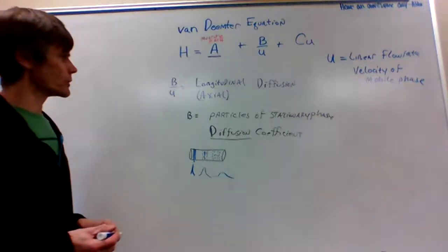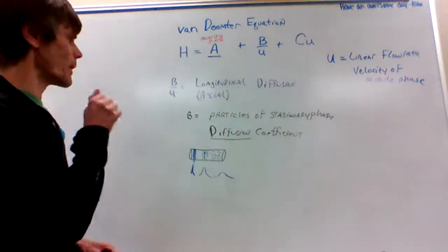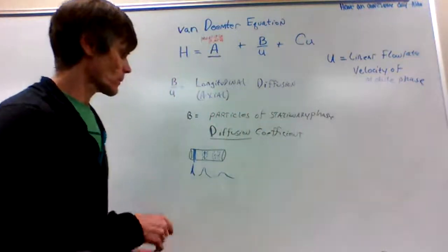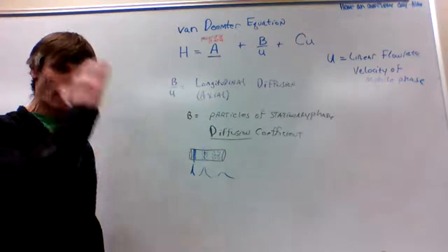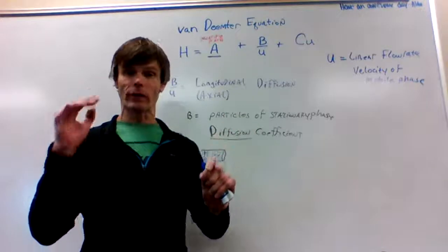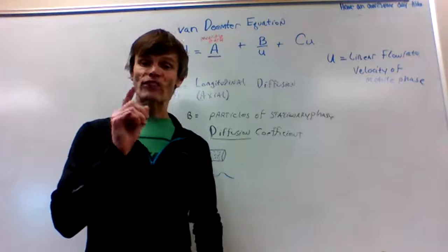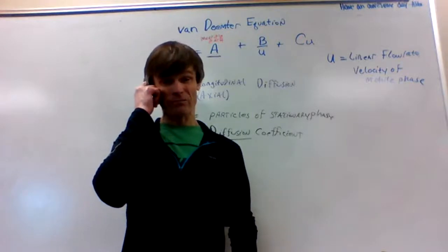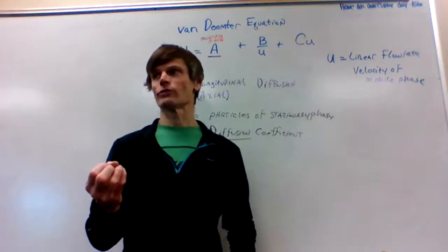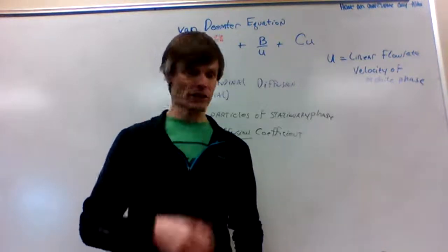Now, my question is, why is it inversely related to our flow rate? So let's think about what we can do here. We could speed the flow up. If we speed the flow up, we're going to beat that diffusion because now we're moving that solute down there quicker. There's less time for it to diffuse because we're able to put it up here and then get it out a lot faster. Remember, we said one problem with too fast of a flow rate, and that's our next term, is it doesn't allow retention of the different particles in the stationary phase. And that's our last term that we're going to look at, our C term.